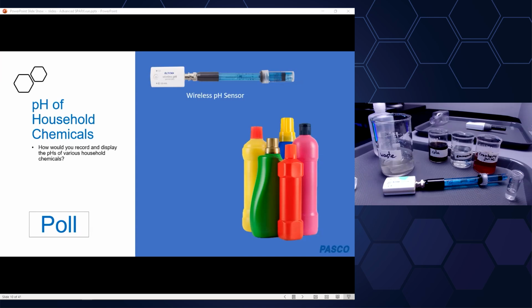So majority of you have already answered. I appreciate that. Give you about 10 more seconds to share your thoughts on what's closest to your plan for recording the pH of chemicals. Fantastic. So let me go ahead and end that poll, and I'll share the results. All right. And here we can see the most popular answer.